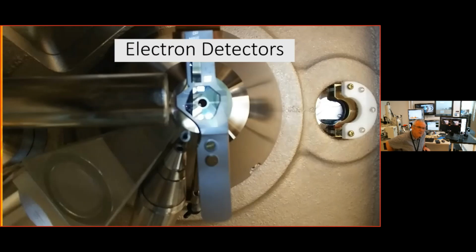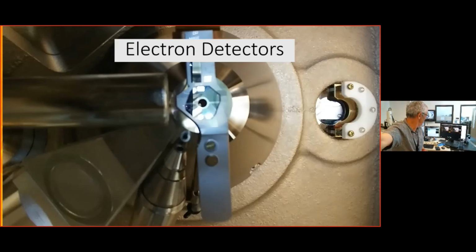Recently I got a new microscope and the situation's become a lot more complicated, but essentially we have two main types of electron detectors. We have what are called secondary electron detectors and what are called backscatter electrons. Secondary electrons are low energy electrons that come off of that sample. They lose a lot of energy in the sample. And backscatter electrons are electrons that come off the sample with almost the same energy as the beam. They show us two very different but very complementary things.